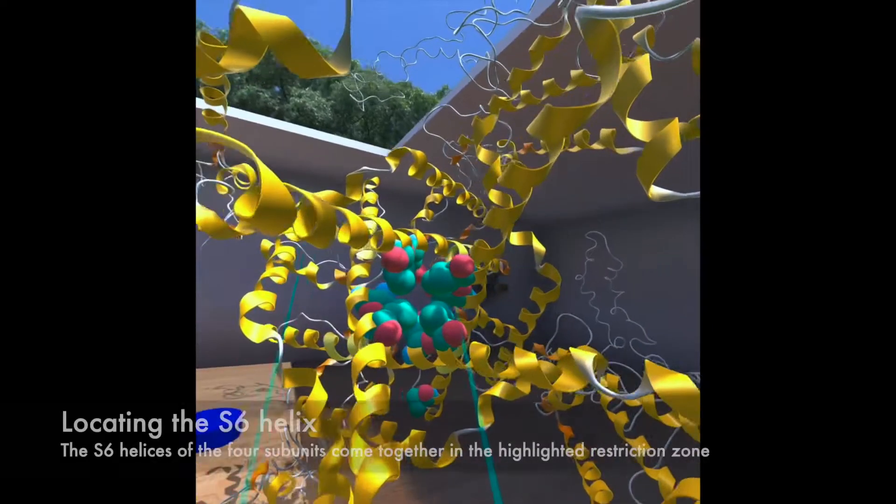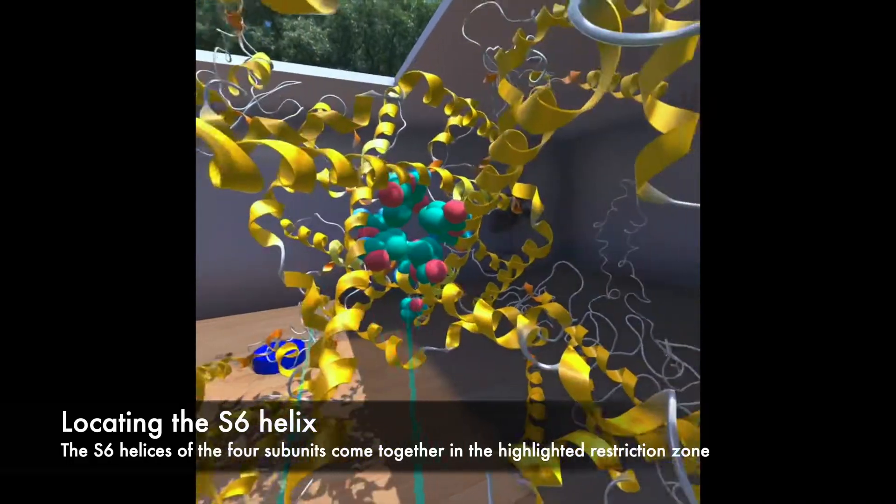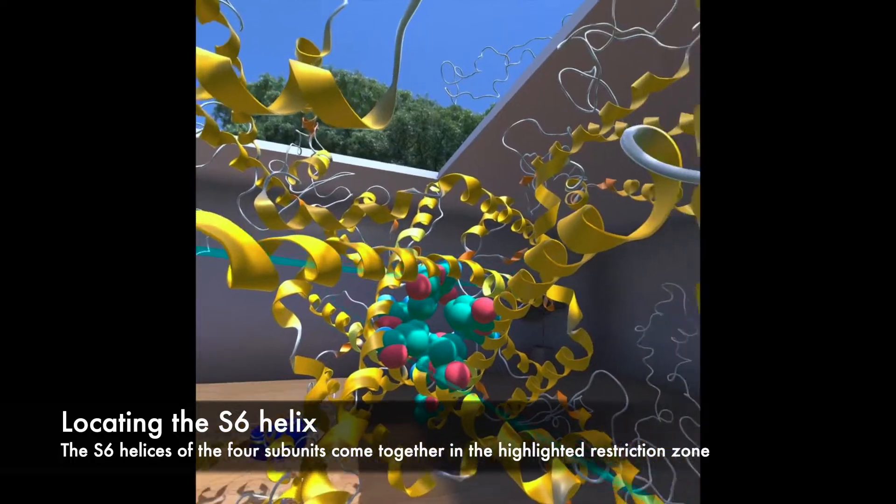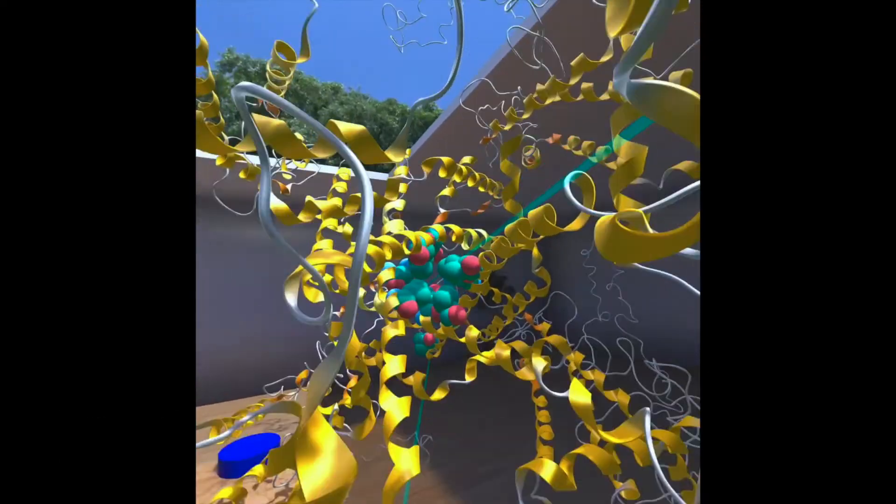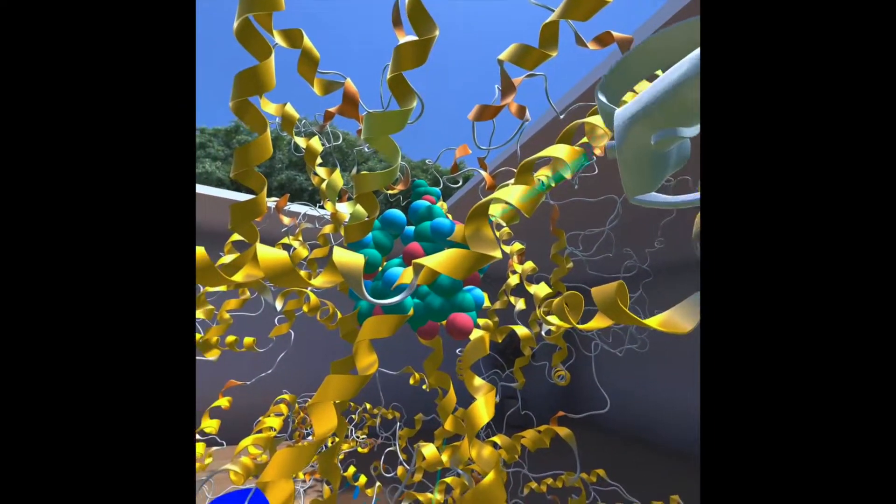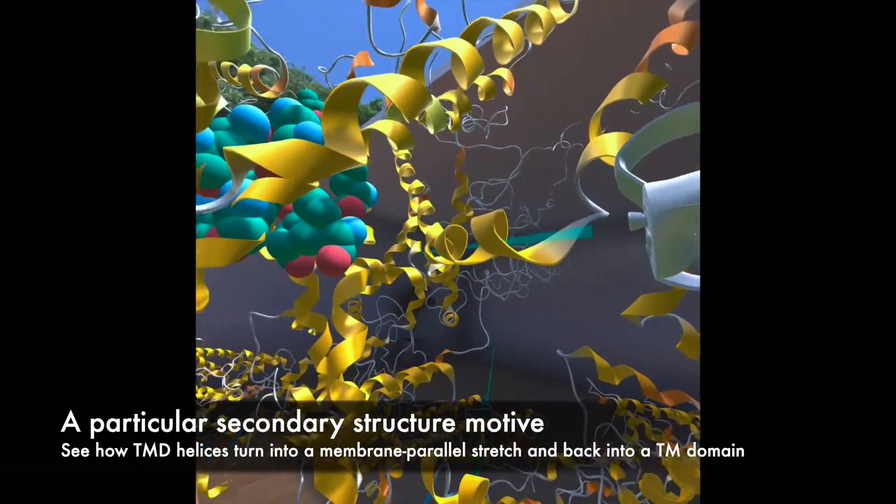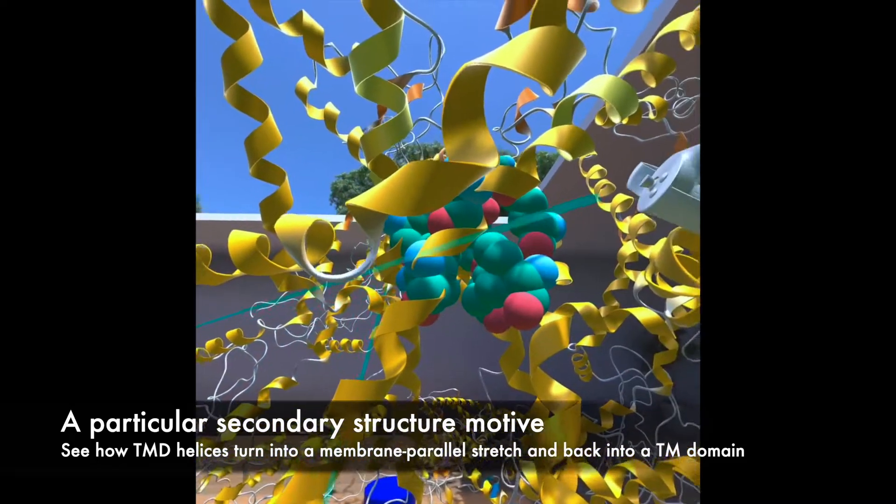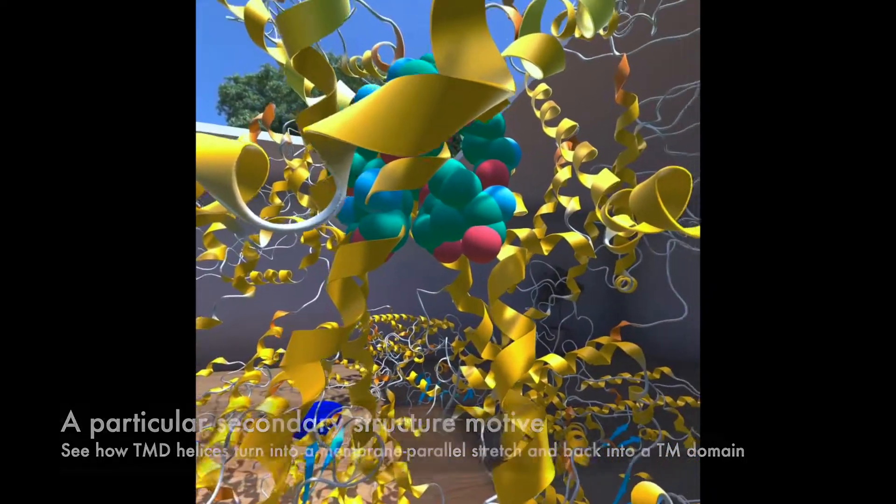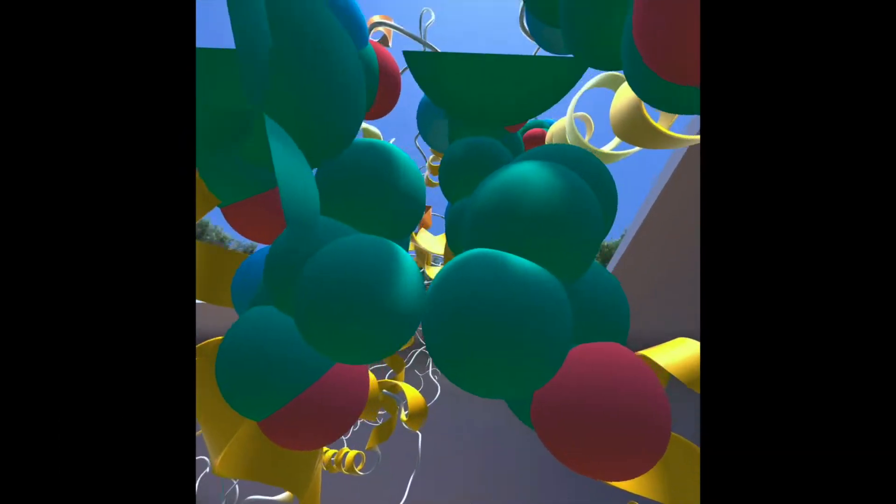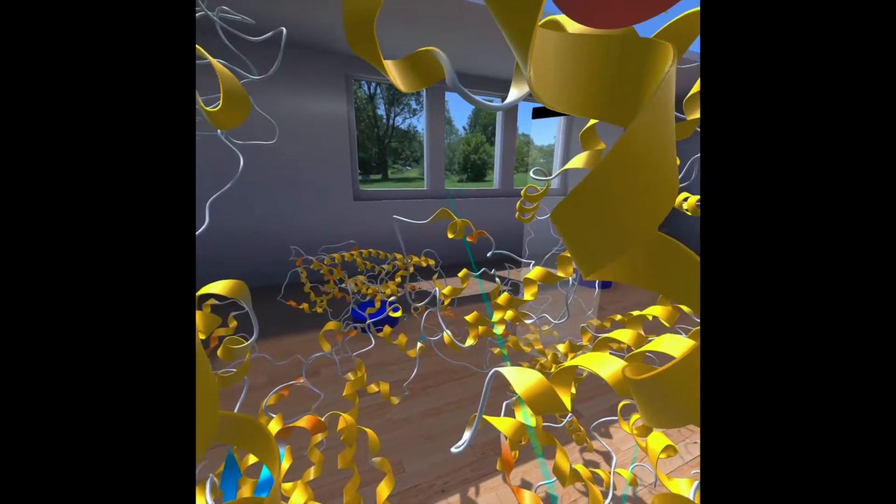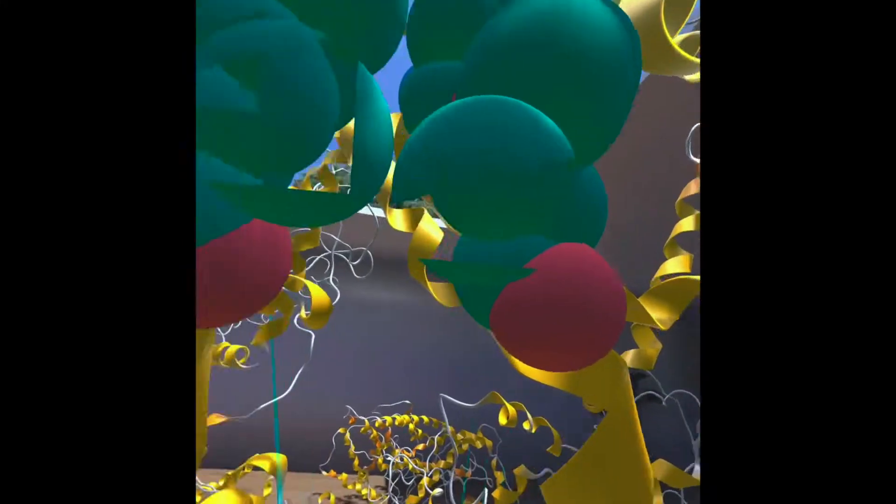And of course they sit on the long S6 helix here. And here. And here. And here. You can see the S6 helices that make up the channel. What's also nice if I turn this up is you can see how we have this particular motif where helix lies flat. And of course the 4-fold symmetry right at this level, actually of the constriction, that might have its functional importance. And now I'm standing here right in the middle of the channel looking through this very complex structure.